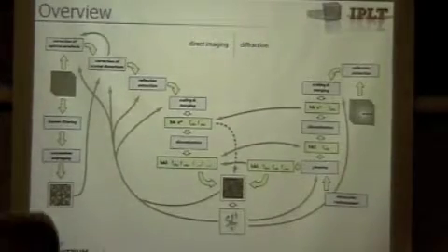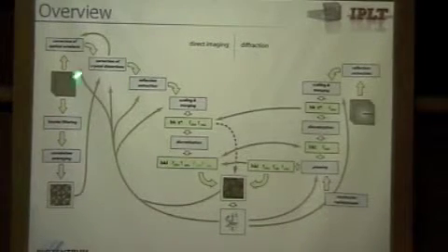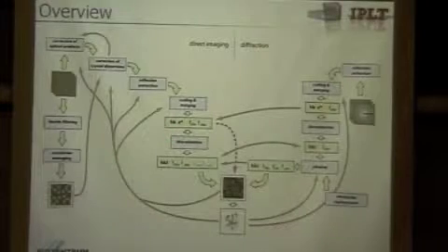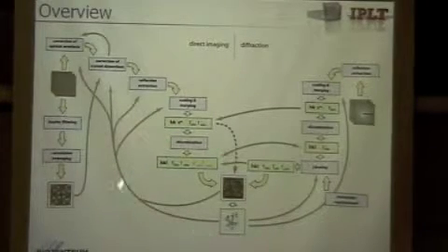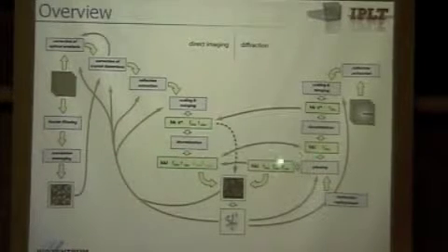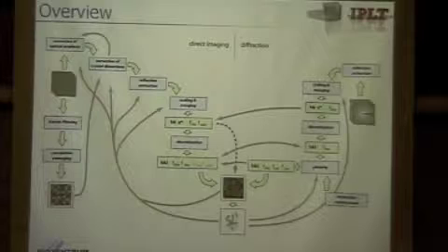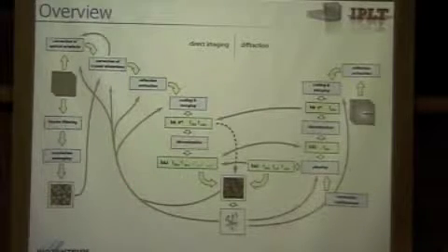Okay, so that's all we already showed about the processing of images, processing of diffraction. And I thought you focus here on the very last part: really, once you have a discretized data set, and for diffraction, once you have done molecular replacement and refinement, how you can visualize this.